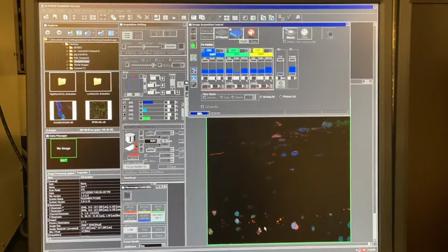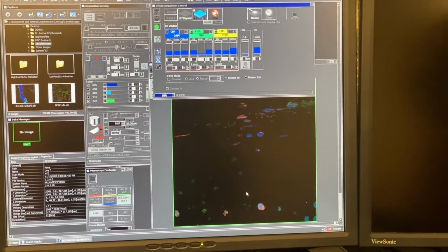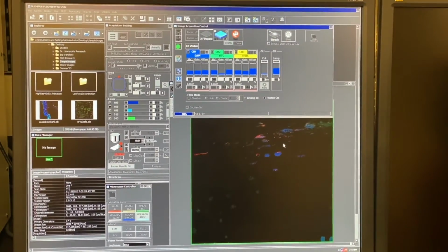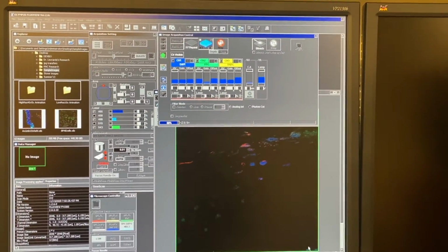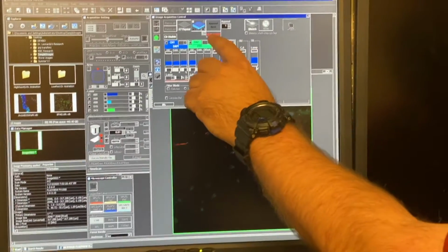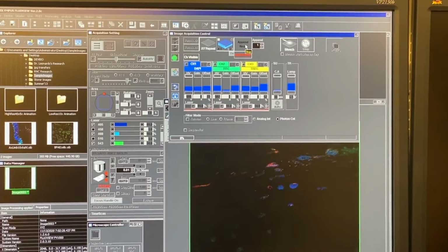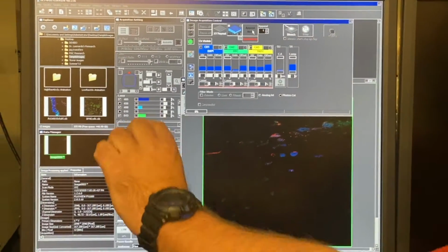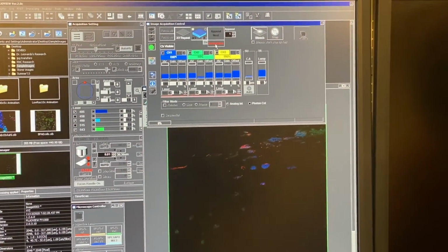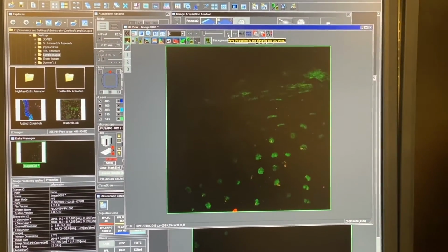And when it's done, it's going to pop up as a final image that will have those arrows at the top that I can move, just like I did through the pollen grain, from one to the next. So there we go, just finished the bottom corner, and it's done. It says, series done. Do I want to take 9 more pictures down into the microscope slide? No, I set my range of where the tissue was actually glowing, so I'm not going to hit append next, I'm going to hit series done. And here's that image, and notice the arrows, I can step through it.